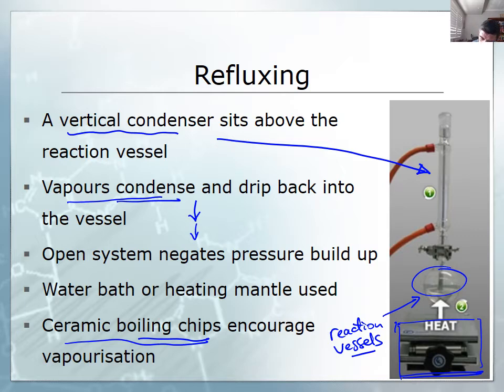The fact that this is also an open system matters, because we know that one of the conditions for equilibria is that the system is closed so that equilibria can establish. So if we open the top of the condenser, then some of the gases will escape. We do have that problem with volatility and potential flammability, but if we can keep the gases away from a naked flame, then we can also get some of those gases to escape from the reaction vessel. Potentially some of that will be the ester that you can smell, and that hopefully will result in the reaction continuing through to establish a higher yield of our ester.